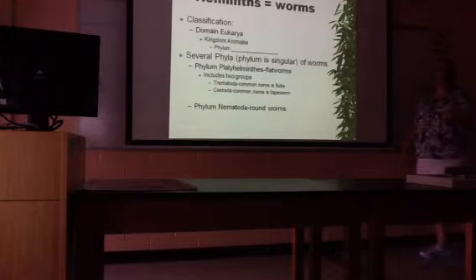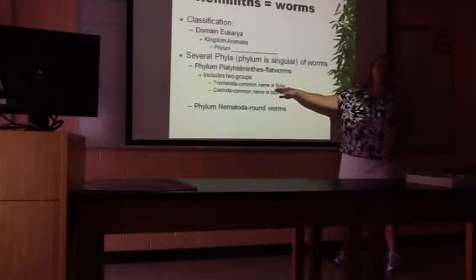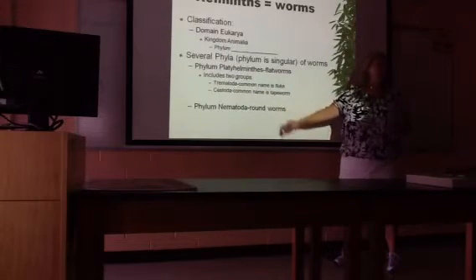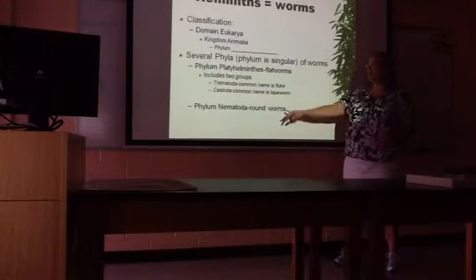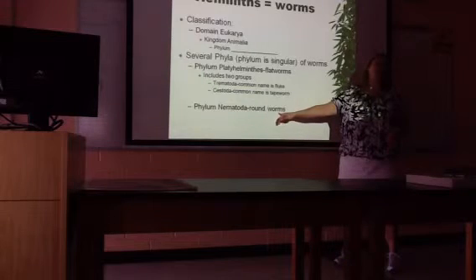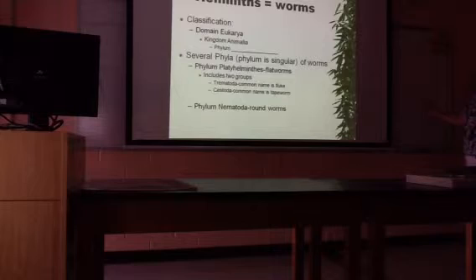Then I'm looking for the overall shape of the body. Flukes are flattened toward the tail. Roundworms are going to look round through their whole body, even at the tail end. And usually, not always, but usually the nematodes are brown in color. Brown is round. So I rule out the tapeworms first.